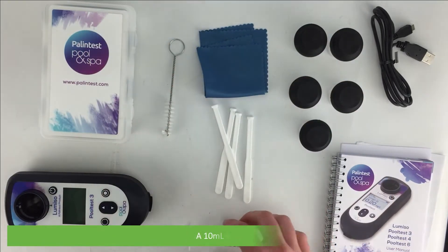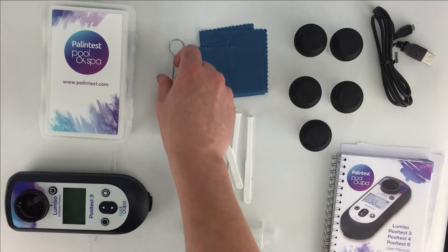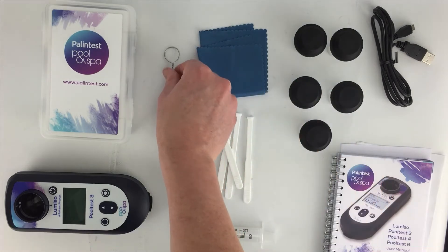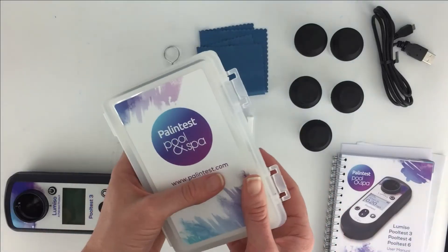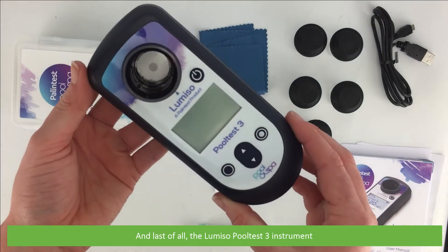There are also four stirring rods, a 10 ml syringe, a test tube brush, a box of reagents, and last of all there's the Lomsio Pool Test 3 instrument.